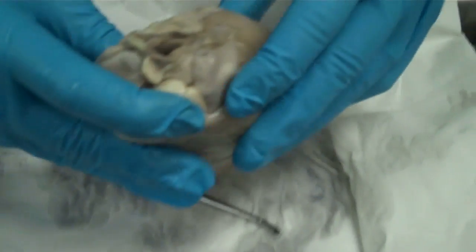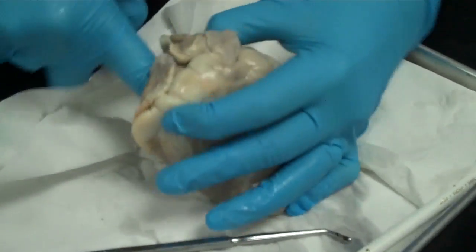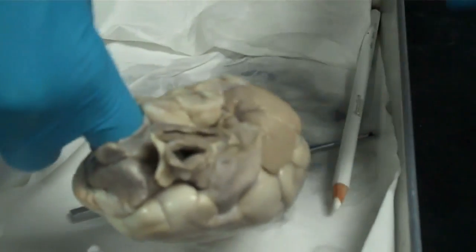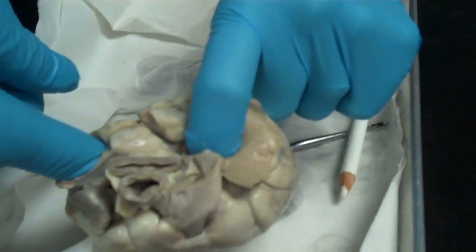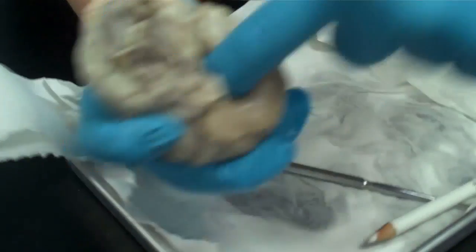On the backside of the heart, you should be able to find the opening here into the right side of the heart, which is the superior vena cava. And then on the other side of the heart, the opening is the pulmonary vein.